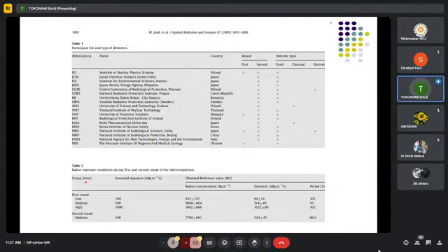So we set at least 3 different exposure levels. Low exposure means the average radon concentration is about 1,000 becquerel per cubic meter. We set different exposure levels by controlling the time. The radon level is 1,000 or 10,000 becquerel per cubic meter.